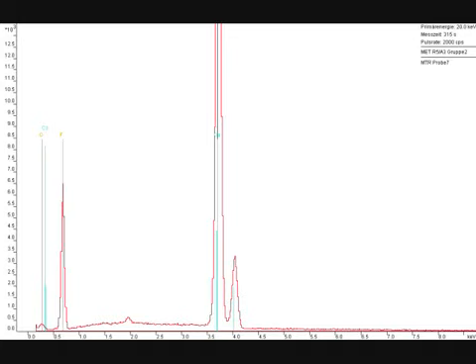That is a so-called escape peak. This is actually an interaction within the silicon detector. You know, there's of course something that detects those X-rays, those characteristic X-rays, and all the others that are produced within the sample. And the peak you can see here is the K-alpha peak of silicon, actually. So it's actually the silicon atoms getting ionized by the X-ray that hits them. And as we discussed before, there may be Auger electrons in the process of filling up the empty shells. And when that happens, those Auger electrons may actually escape the detector, leading to those very specific escape peaks.